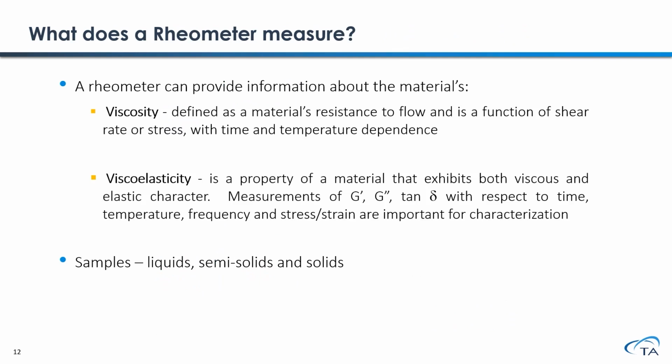So next, what does a rheometer measure? As we have mentioned before, rheology studies materials' viscosity, elasticity, and viscoelasticity. So a rheometer can provide measurements on your material. It can measure your sample's viscosity. It can also measure your sample's viscoelasticity.